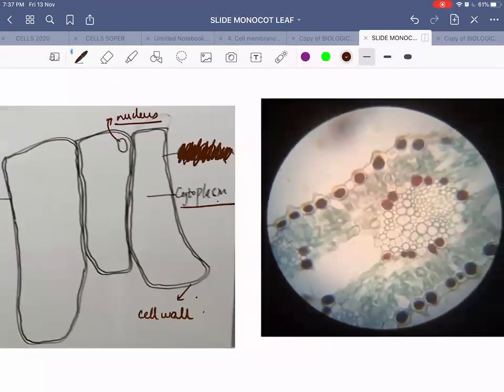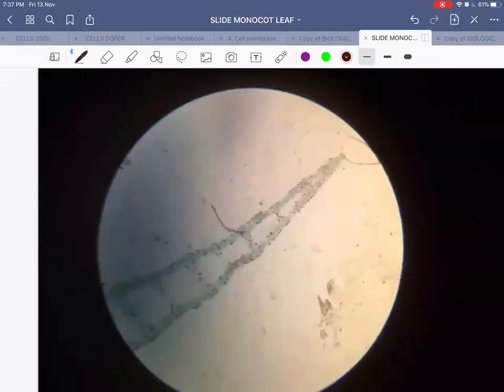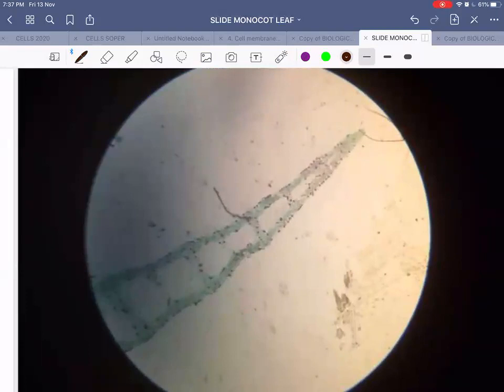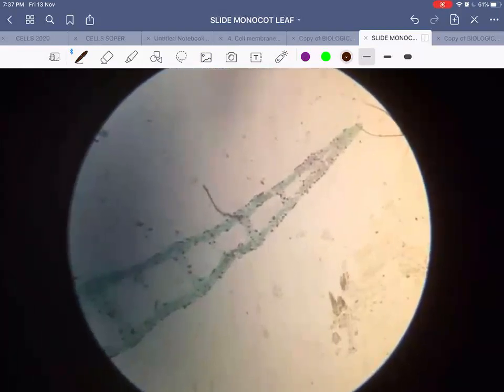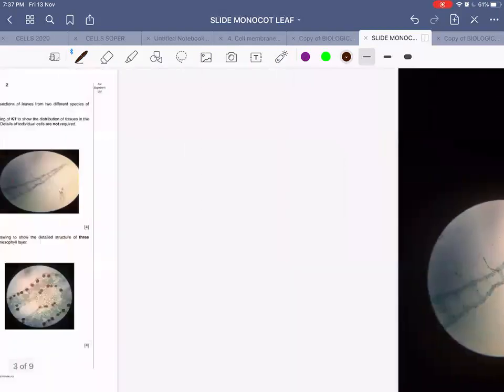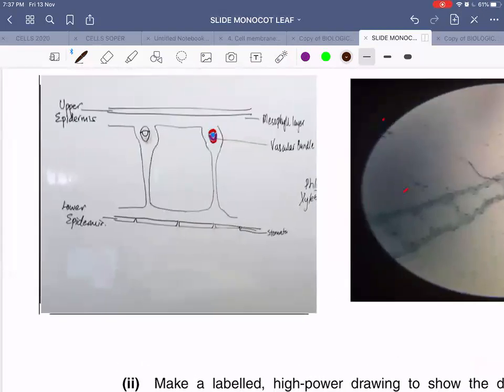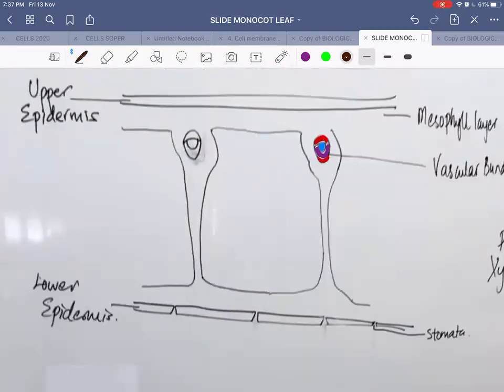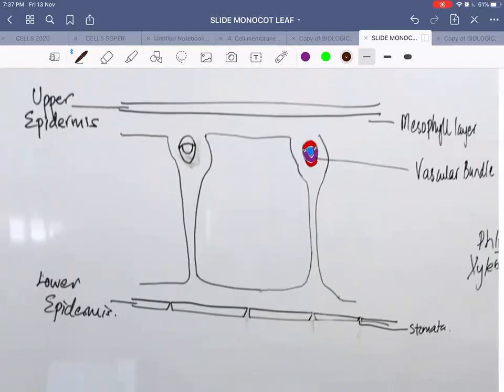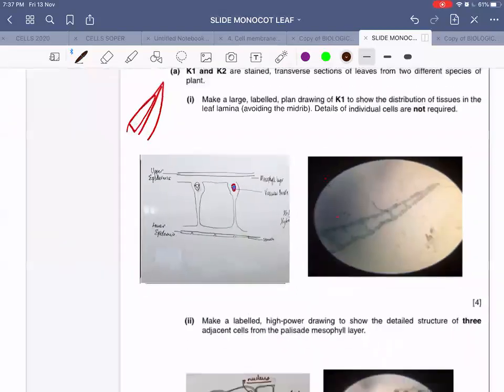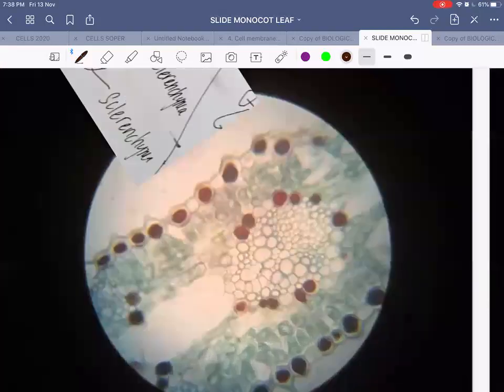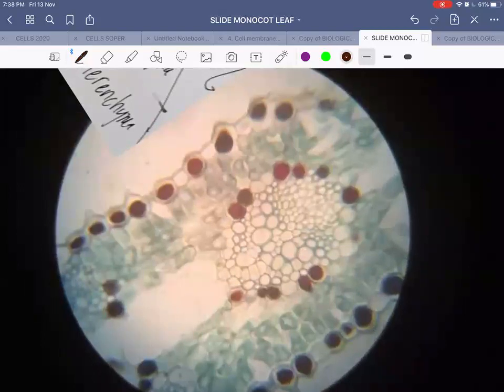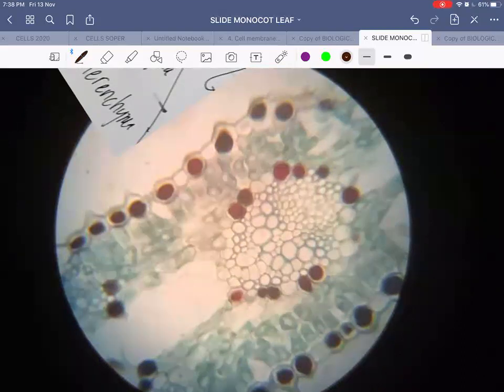Since all plant cells have a cell wall, it is represented by a double line. The cell membrane you cannot see at all, so ignore that label. A low power photomicrograph of this monocot leaf shows the upper epidermis, lower epidermis, and large air spaces. If you zoom in, you will also see that the lower epidermis has stomata, shown as empty spaces — present on the lower epidermis but not the upper.